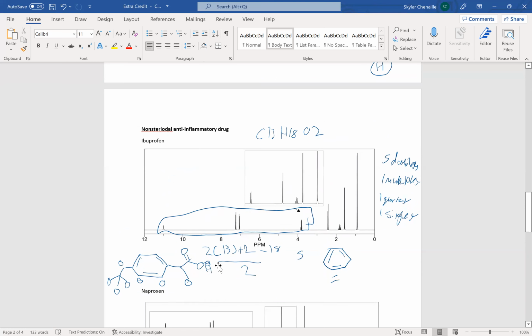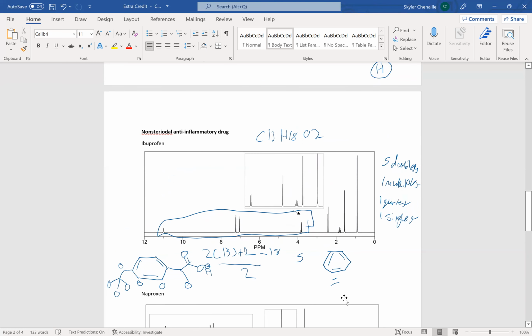So now let's confirm this using what we know about the coupling and why there are certain amounts downfield. So if we look at these ones in here, we have our 2 electronegatives, our oxygens. That's going to force them to come up this way, right? We have our 1 hydrogen here, which is going to be one of these doublets. We have another right here. Actually, right here. Sorry, this is our other doublet. There's another one right there. That's my bad. So that would be hiding out, making this other one, which makes complete sense because we have these 2 oxygens here and here still, pushing it further to the left.